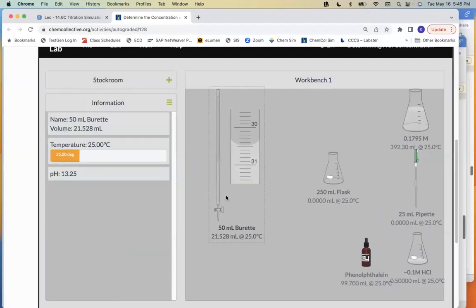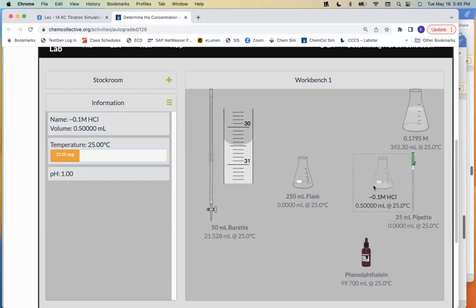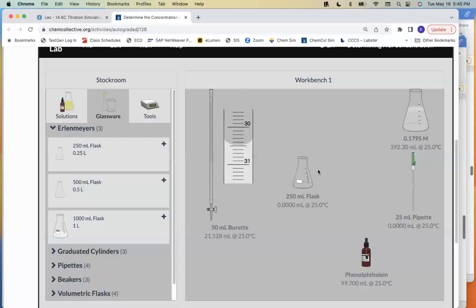So it's definitely less than 14 then. I'm going to need probably maybe 12 and then I'll slow down. So let's grab, I think I'm almost out. Yeah, I'm out of acids. I'm going to grab more.